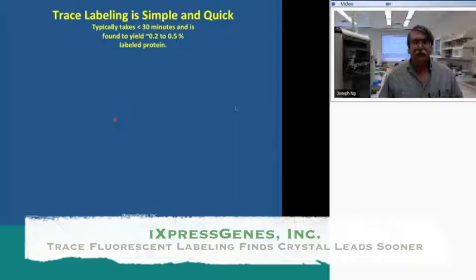So how do we label the protein? Initially this procedure took a long time, most of the better part of an afternoon. We've now worked on it to the point where it can take us less than 30 minutes, and as short as 5 minutes if possible, or if needed.